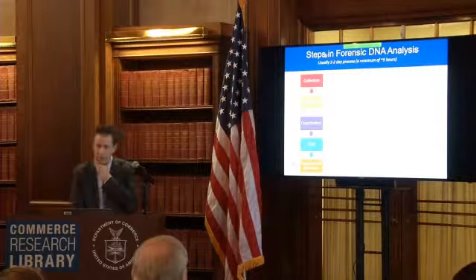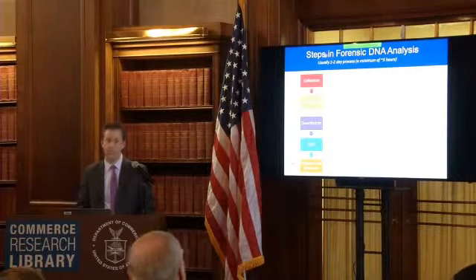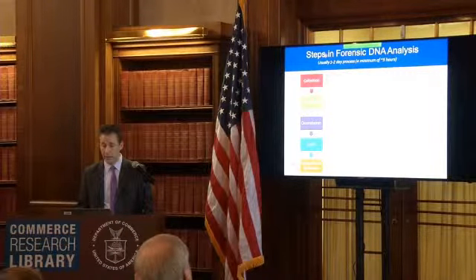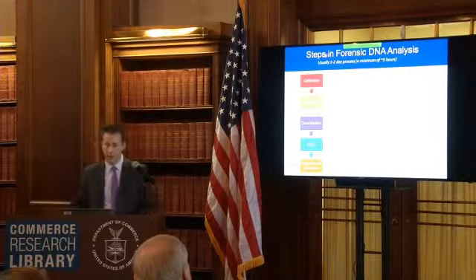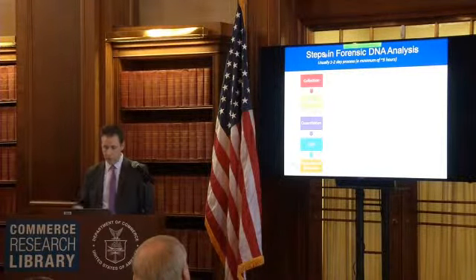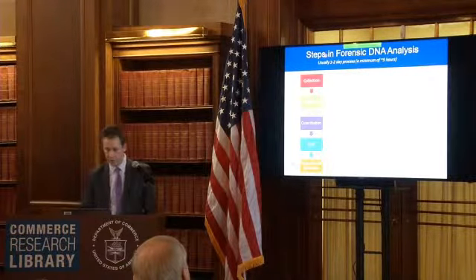What I wanted to get into now was just the actual lab work, or the steps in forensic DNA analysis, so you can get an idea of what goes on in a test. And I've broken this down in these different steps of collection, extraction, quantitation, PCR, and then separation and detection. And I'll talk a little bit more detail about PCR and separation and detection.